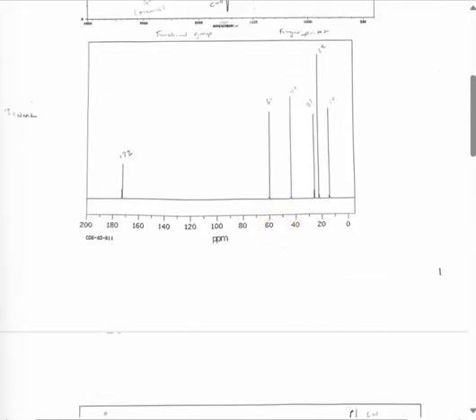So referring back to the 13 carbon NMR, the first spike that we will see was at the 172 marker. We know that this is a carbon that is attached to more electronegative atoms, such as an oxygen, and they would appear more downfield over to the left and would thus be at about the 180 to 170 marker, which is what we see right there.